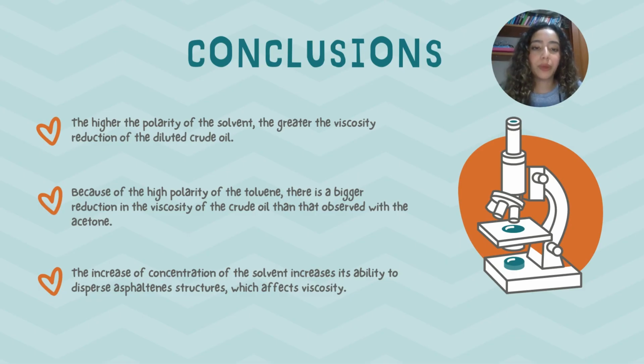In conclusion, we were able to achieve the objective of assessing the viscosity reducing effect of organic solvents on crude oil. Additionally, we determined that the major problem of the transport of heavy crude oils is that they have high viscosities, and for that reason it is very important to add a diluent to reduce viscosity. When mixing solvents that have polar functional groups in their molecule with the crude oil, it is determined that the dilution efficiency of the crude oil is enhanced.